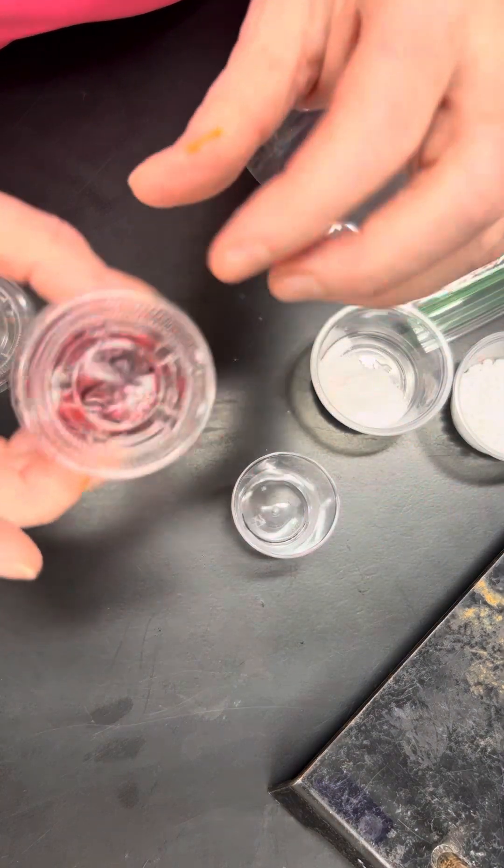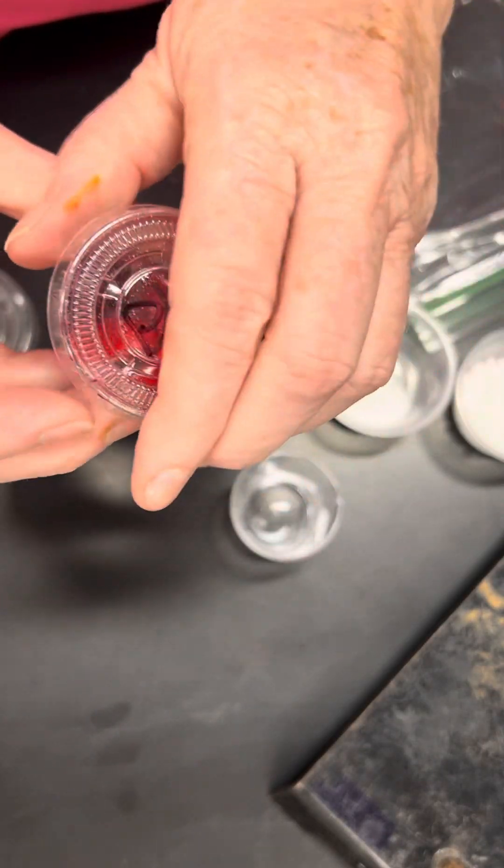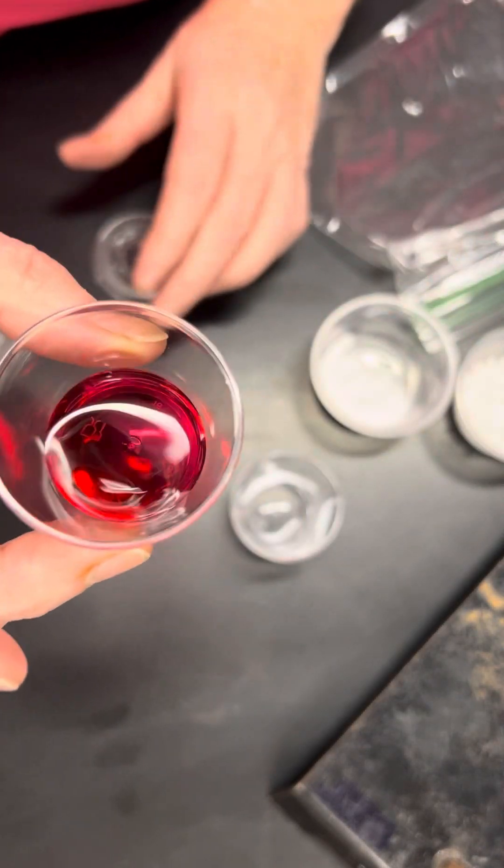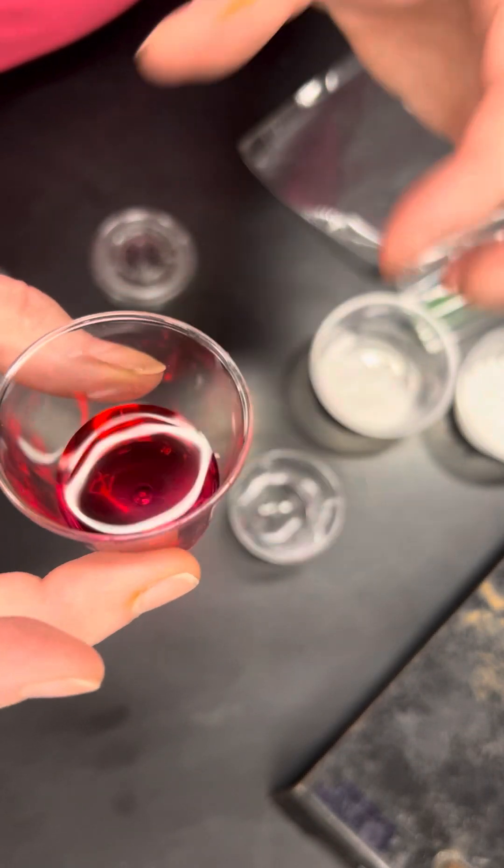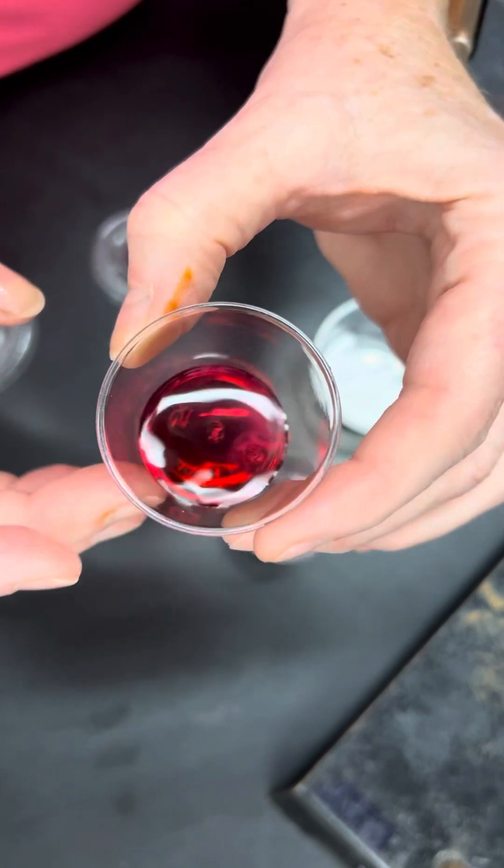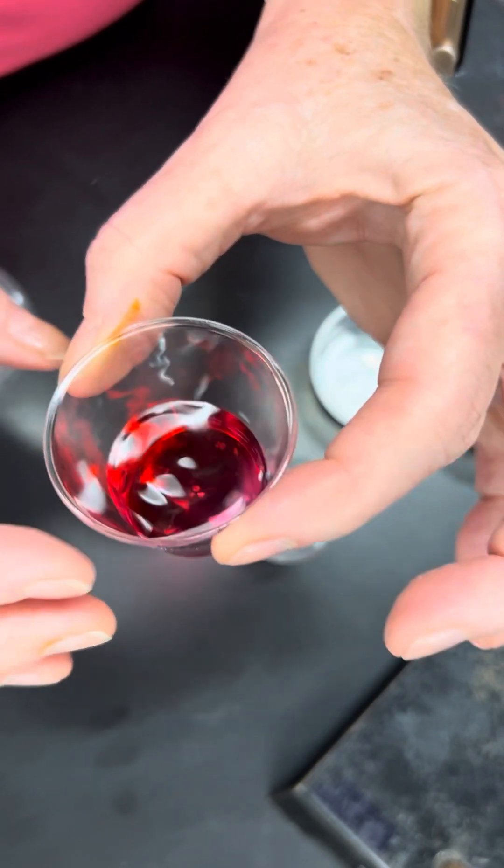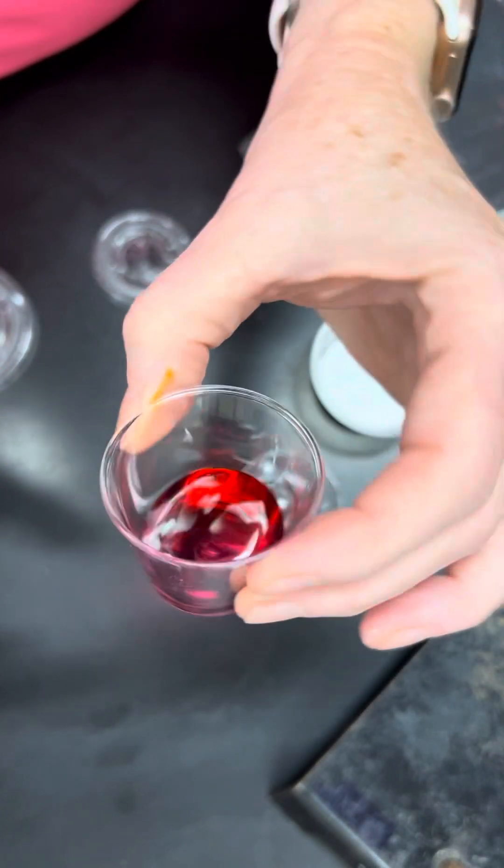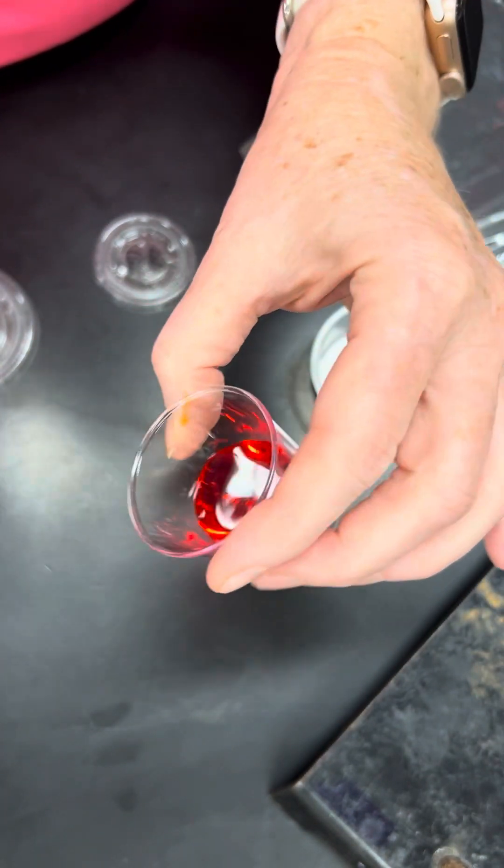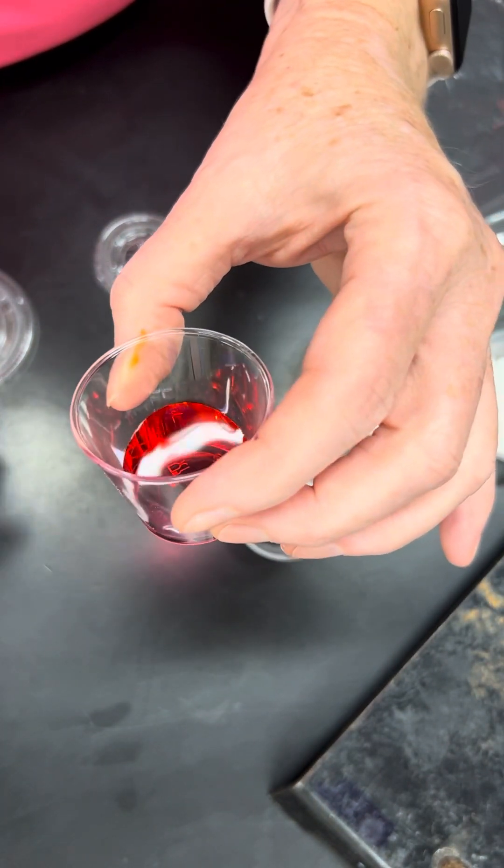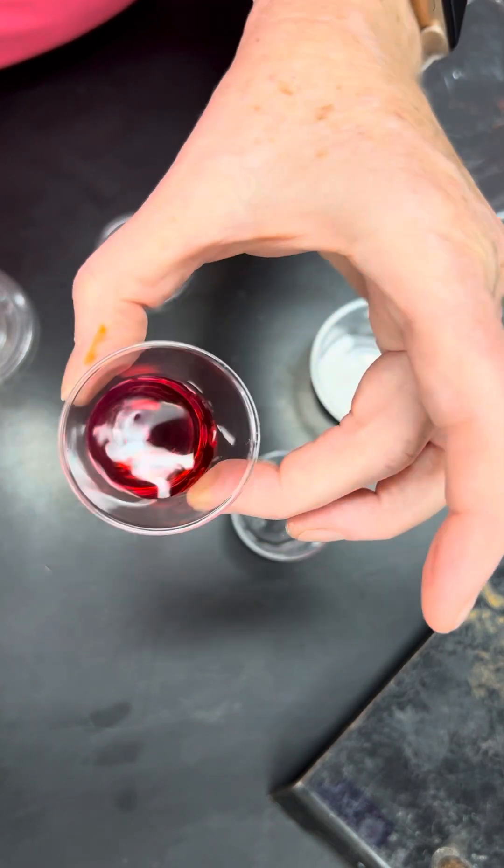The next substance is PR or phenol red. Phenol red is a liquid. It is red colored, kind of a dark pink almost or very light red. It is very thin and liquidy, not thick like honey. It pours very easily and readily. This is also toxic to humans.